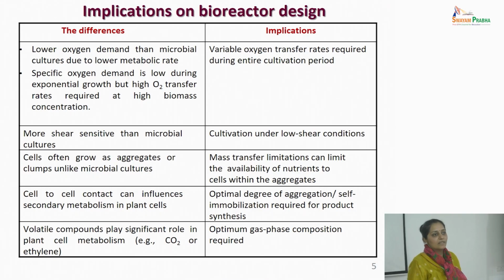Because of that, whatever models and assumptions you make in your models, you assume that these are homogeneous suspensions. So therefore, there's no heterogeneity. The viscosity is always the same. Based on these assumptions, all these microbial fermenters and fermentations have been designed. Now plant cells will deviate.